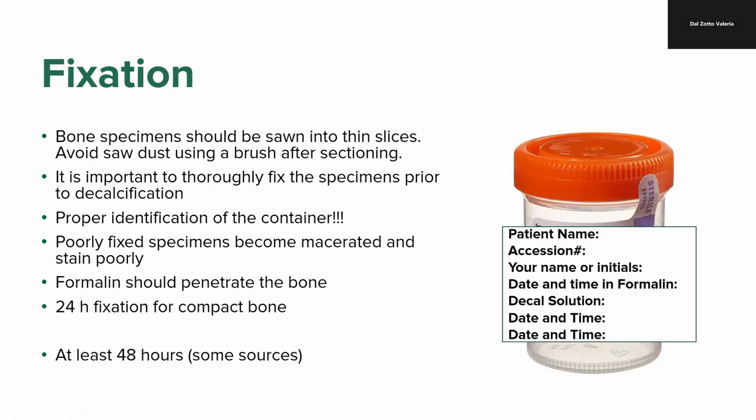The handoff can be by written email or in person. And if there is no resident taking over the bone soft tissue subspecialty, you may need to do the proper handoff to the PA supervisor. But this is an aside, we're going to talk more about handing off specimens. You are going to identify the container and document how many times you change the solution, for the person who is taking over the case to be aware of.